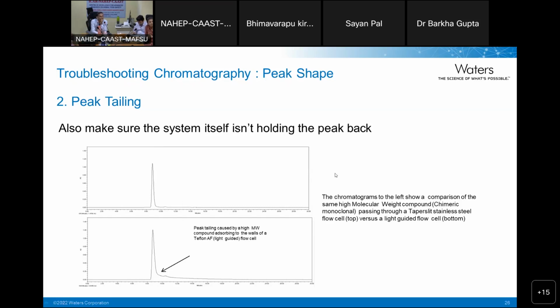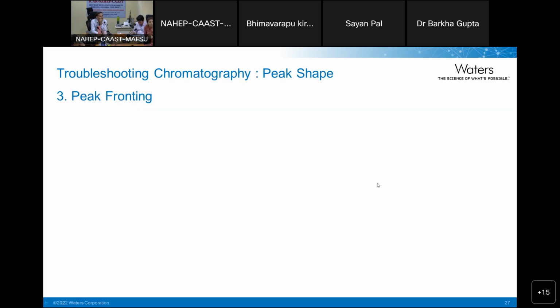Right? There is nothing wrong with this system, only the component is so specific that it requires some specific material to perform those analyses. Now, the peak fronting, another common issue.